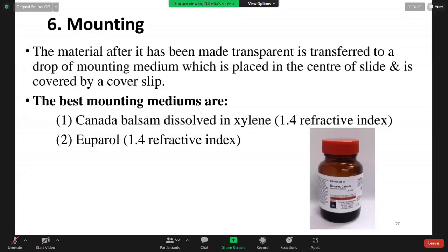First, we collect the specimen. Second is the pressing. Third one is drying, and then poisoning.